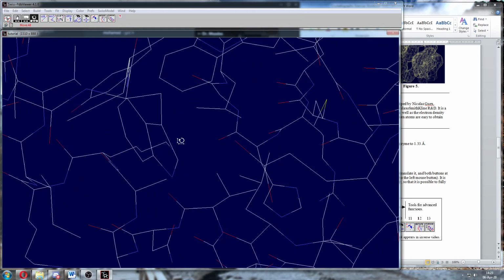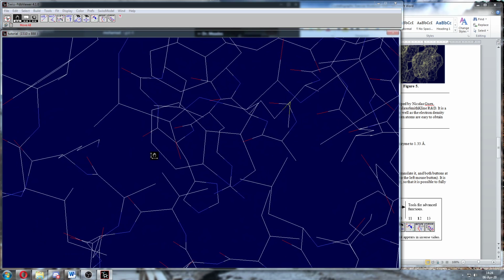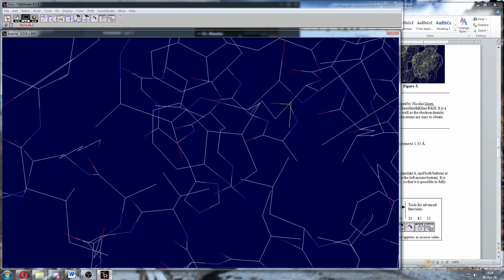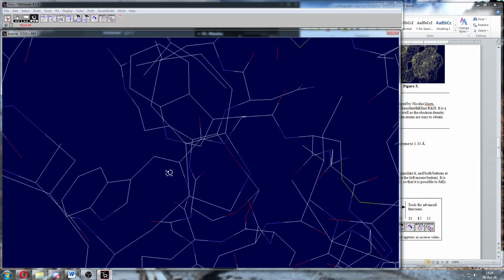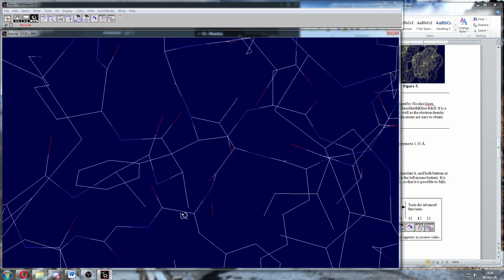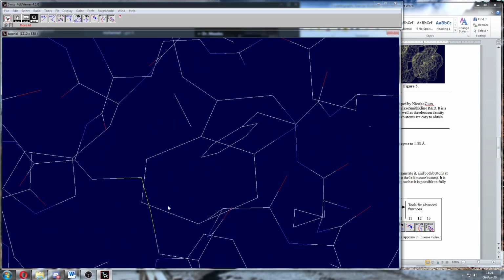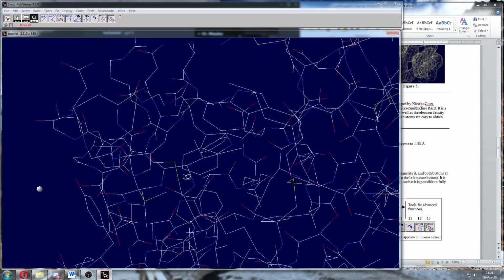You can rotate it a little bit, and then I can translate using the hand over to here to get it in the center again. We'll try zooming one more time. And if I rotate it, it may go off the screen. Right? It's not doing a bad job of staying, but if I rotate over here, it goes off the screen. I'd like to keep it here. So I can zoom out some.